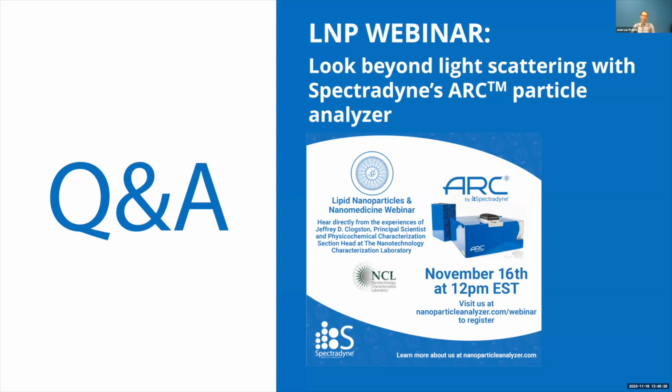Effectively, every time we measure a particle, which happens many thousands of times in a measurement, we are measuring the flow rate at the same time, and the transit time is calibrated as a parameter for the cartridge that's factory calibrated. So it's not something you have to do. Hopefully that answers your question. And the second part was, what is the total volume of sample analyzed? The total volume of sample analyzed is small.